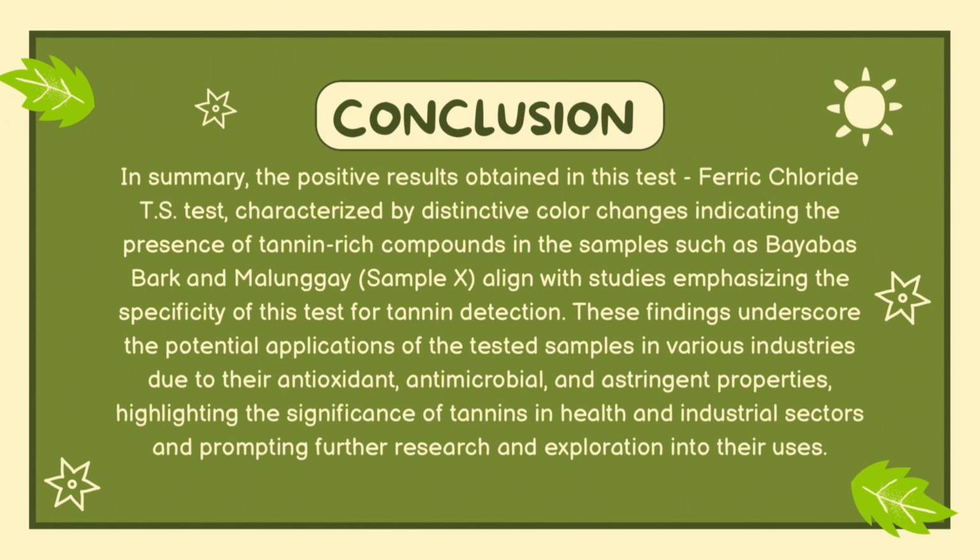So what we can conclude from this? Our samples tested positive because there is presence of tannins in them, which reacted with ferric ions in our ferric chloride test. The positive result obtained in this test is characterized by distinctive color changes as shown earlier, indicating the presence of tannin-rich compounds in the samples utilized such as bayabas and malunggay, and this aligned with the studies emphasizing the specificity of this test for tannin detection.